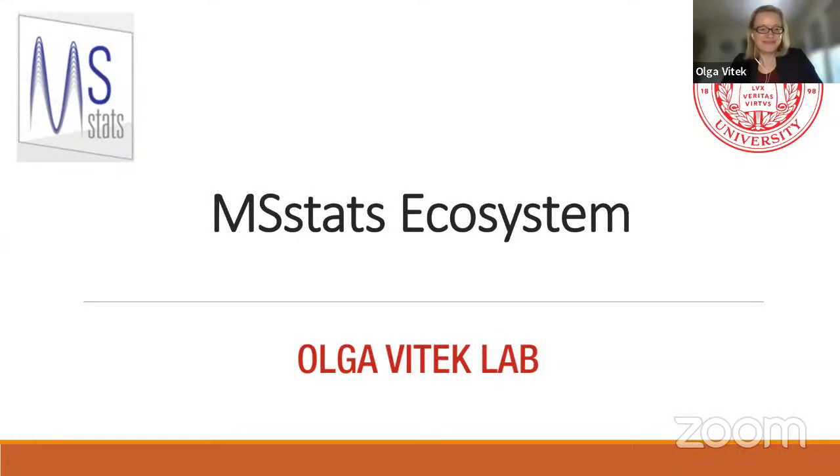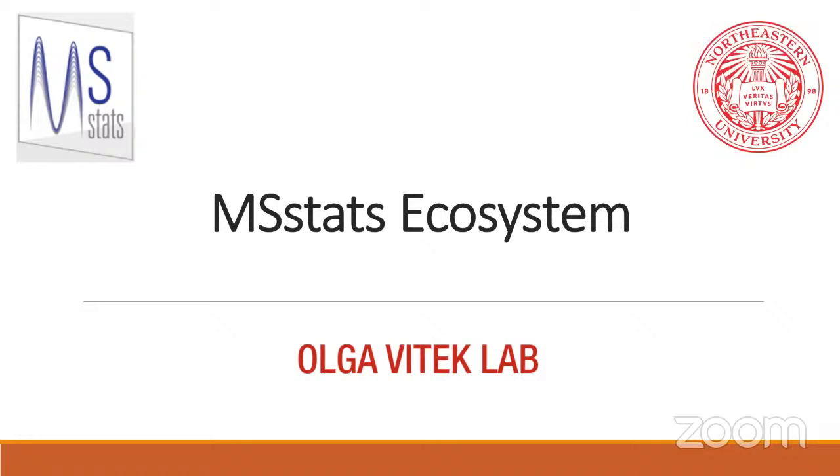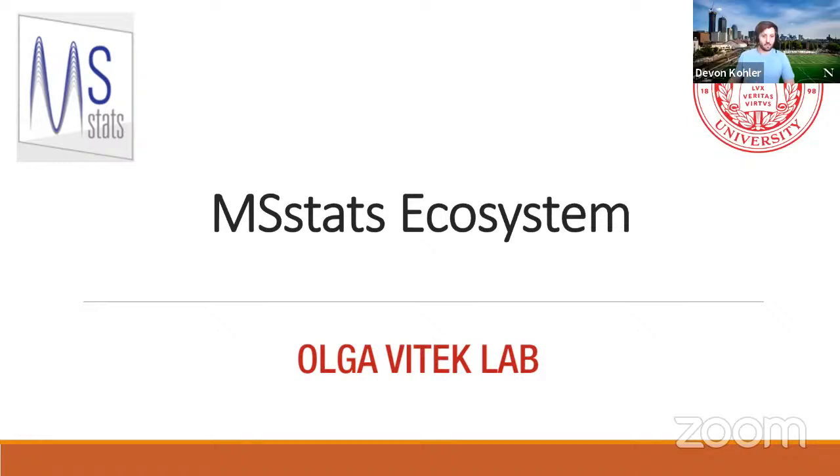Yeah, like Olga mentioned, I'm going to go over the MSstats ecosystem today, just go over what packages are available, how you can use them, and then their current status and what we're developing and what you can expect in the future. So first, I'm just going to go over the team so you can get a face to everybody who's developing everything.